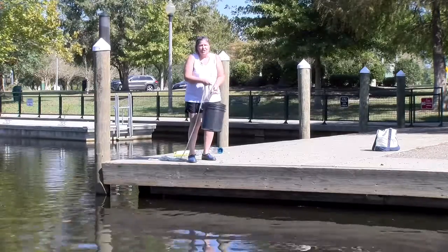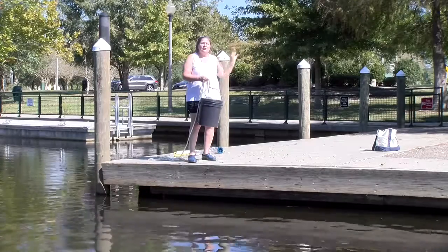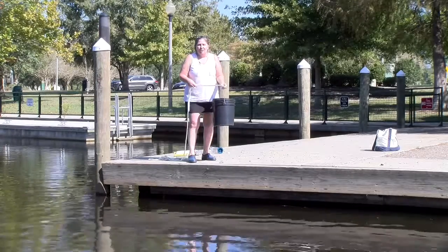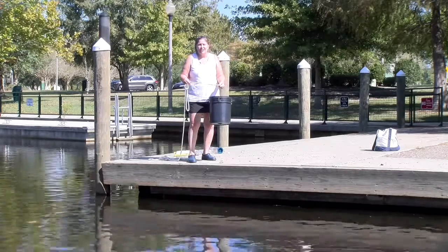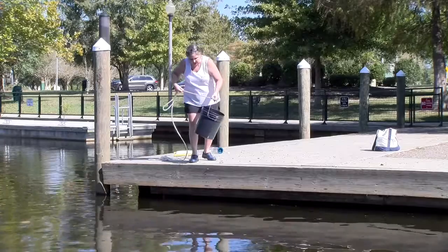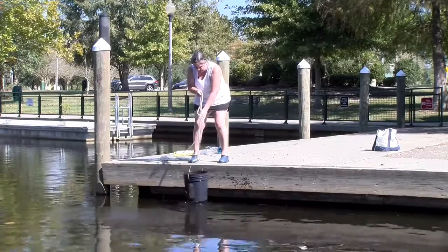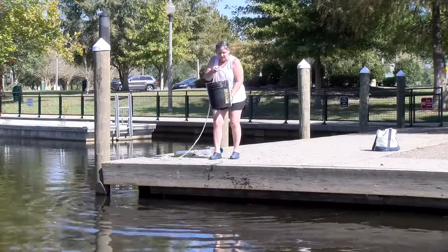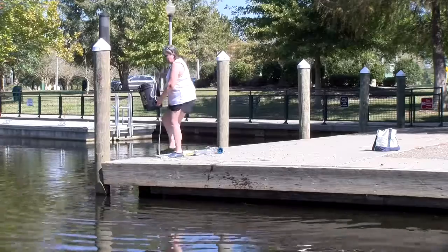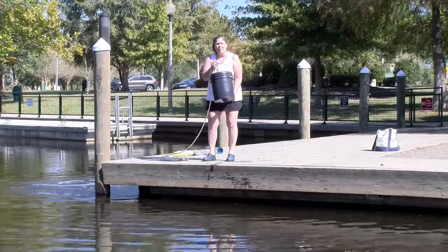The first thing you should do is rinse your bucket out to make sure that there's nothing in your bucket from a previous site or maybe accumulated dust or dirt that may have sat in your bucket over time. So rinse your bucket out by getting some water in it, swooshing it around, and dumping it away from where you're going to take your sample.